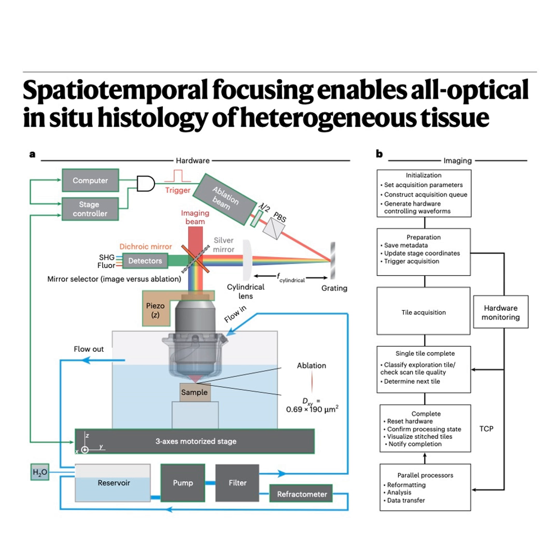Okay, this whole system is incredibly complex, integrating optics, fluidics, robotics, and intelligent software control. Let's talk about the payoff. Did it actually work? What results did they get? The results reported are pretty spectacular, really validating the whole approach. They demonstrated it on arguably the perfect test case, imaging the entire craniocerebral vascular network of a mouse right through the skull. From the outside of the skull all the way down into the brain tissue. Exactly, down to the white matter.